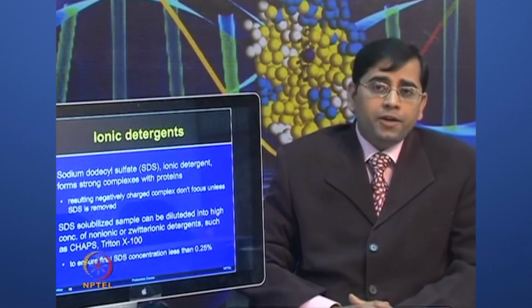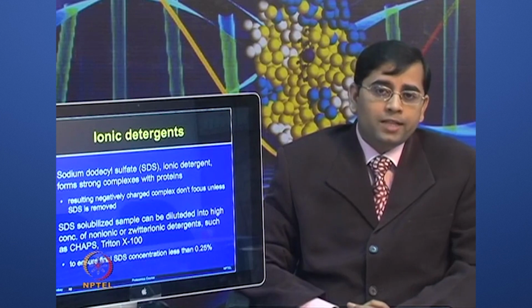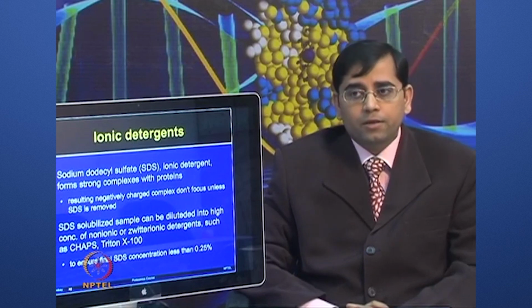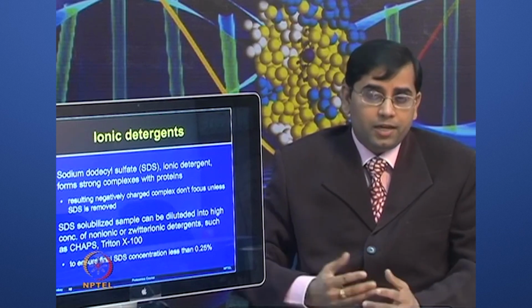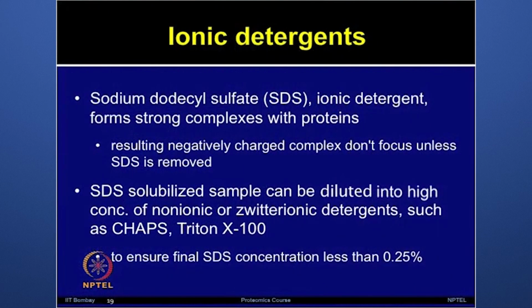Now, let us talk about ionic detergent. SDS, sodium dodecyl sulphate, is an anionic detergent which forms a very strong complex with proteins. We will talk about SDS and how it can be used for gel electrophoresis such as SDS-PAGE. But in this context of protein preparation, SDS is a very efficient compound.